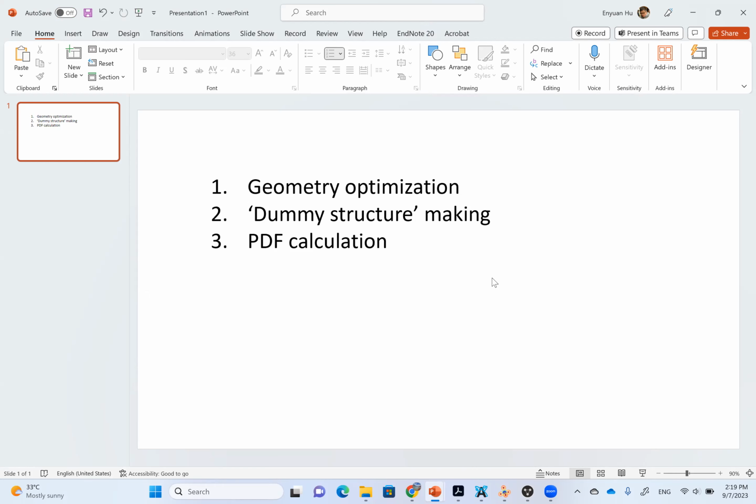What we need to do is create a big unit cell, and then we put this molecule in this cell. So that's basically a P1 cell, right? Each unit cell only contains one molecule. You can imagine there are tons of Amazon boxes, big boxes, but there's only one atom in the center of that. Through this way, we can trick the PDFGUI, telling it, hey, this is a crystal structure, and please calculate the PDF pattern for us. So that's the whole algorithm, or the logic, of how we do the PDF calculation for small molecules.